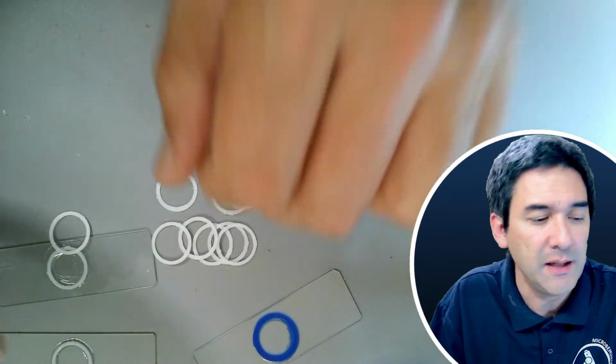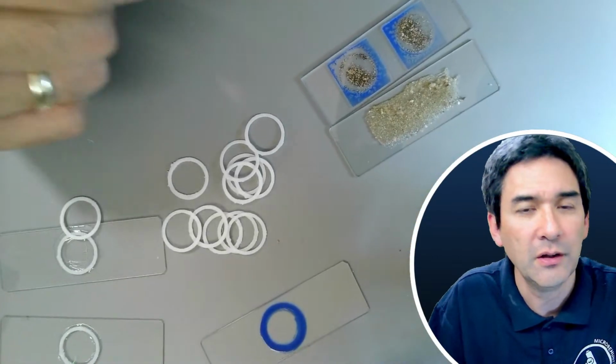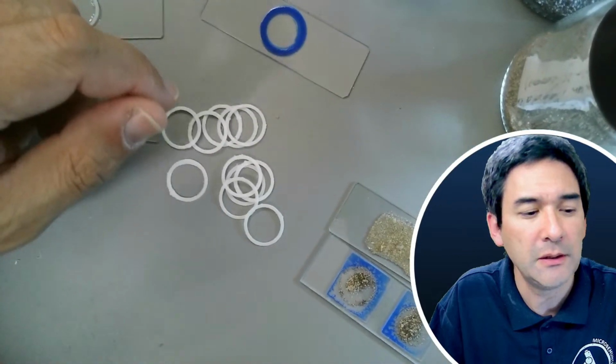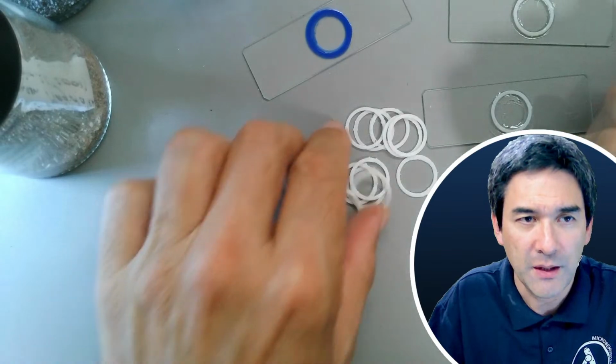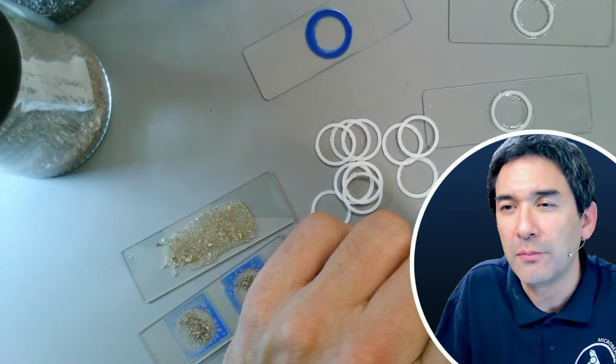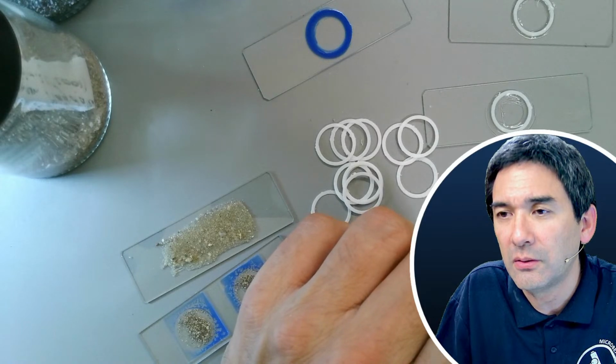You just see that my hands are in the way. Just a second. I've got this new camera here, and with the push of a button I'm able to turn it correctly now. So that's also a little bit easier for me.